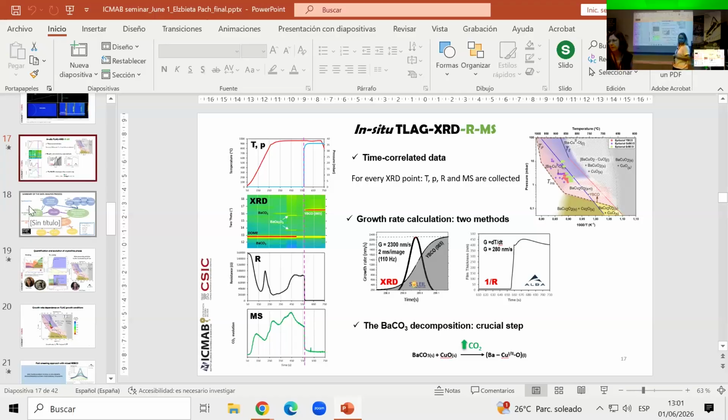Another curiosity: you explain with the XAS that you get different valence of copper, but do you use a specific model, because you say 1.6, 1.5? How do you calculate this? Do you use multiplet calculations, what is the model? Well, we developed a method based on the reference spectra of full copper +2 and full copper +1 in our films. It's just the intensity comparison between two extreme values.